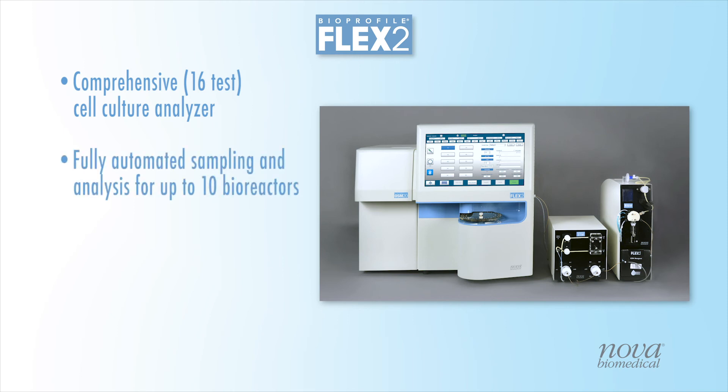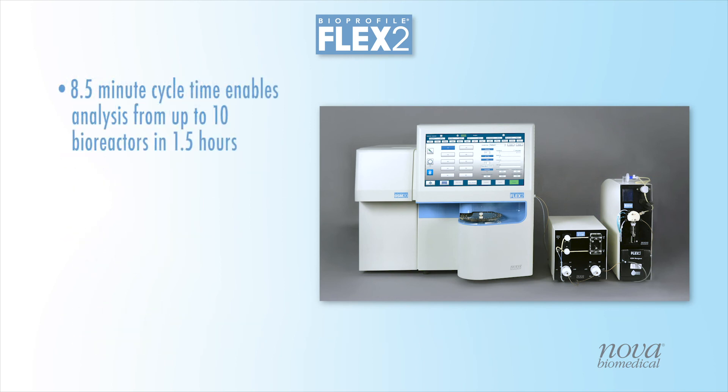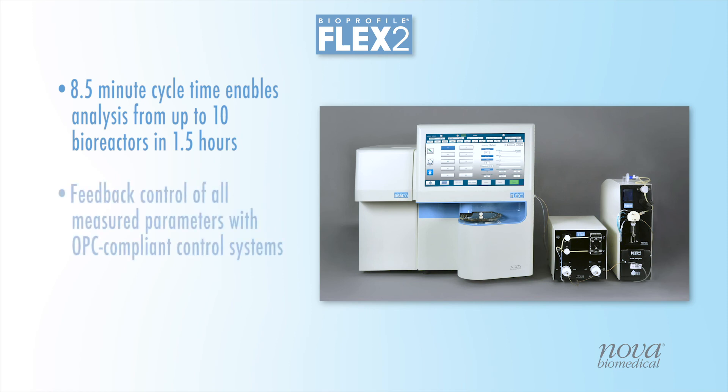The Flex2 OLS provides fully automated sampling and analysis for up to 10 bioreactors with walk-away automation for up to 3 weeks. A small sample volume of 5.6 milliliters allows frequent sampling, while an innovative fluid path design enables throughput of just 8.5 minutes per bioreactor. As an OPC-compliant system, Flex2 with OLS enables custom feedback control for all measured parameters with infinite possibilities for the most advanced process control strategies.